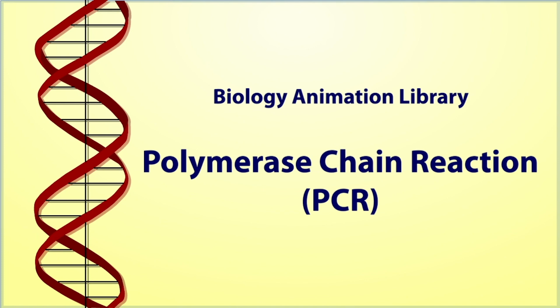Let me first introduce what is polymerase chain reaction using an animated movie. Polymerase chain reaction, or PCR, enables researchers to produce millions of copies of a specific DNA sequence in approximately 1 to 2 hours. This automated process bypasses the need to use bacteria for amplifying DNA.